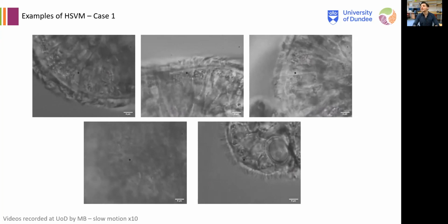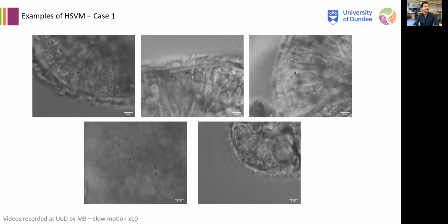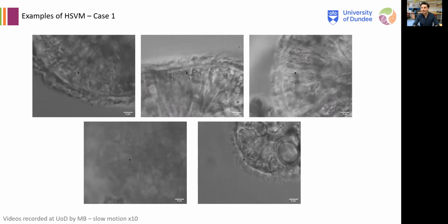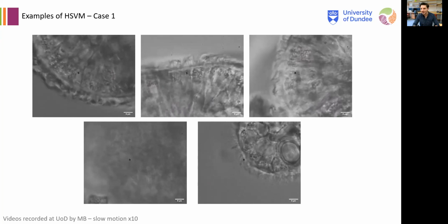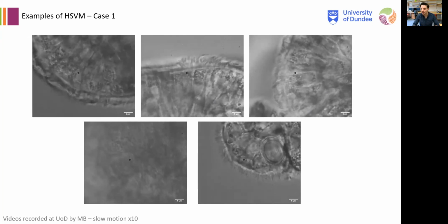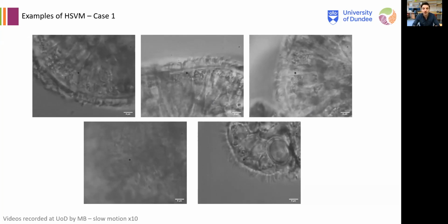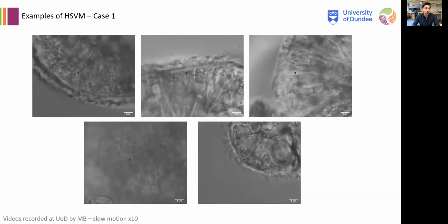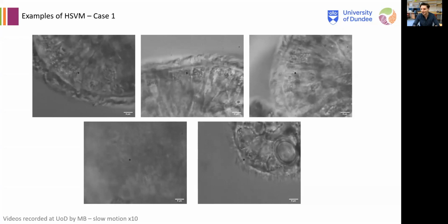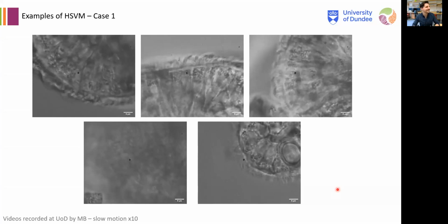What do you guys think? Normal, PCD, looking weird, looking normal? Okay. Yeah, as soon as one person says normal, then everybody will say normal in the chat. So it's actually a patient that we classified as non-PCD. Their parameters actually look normal, so I would agree with the chat. This is normal, and even Amelia agrees, so that's good.